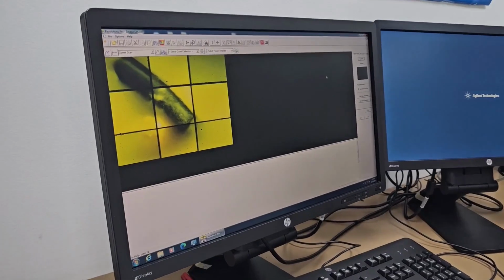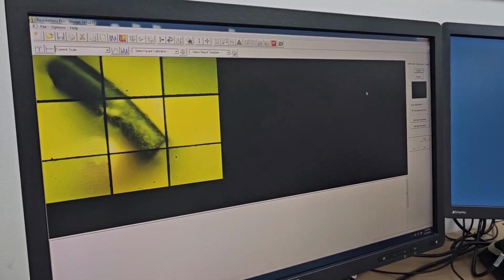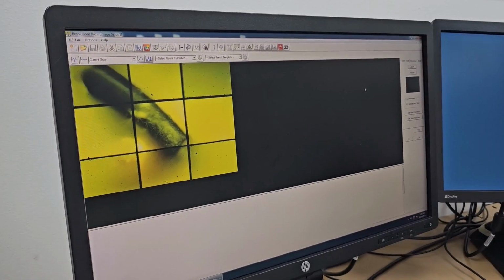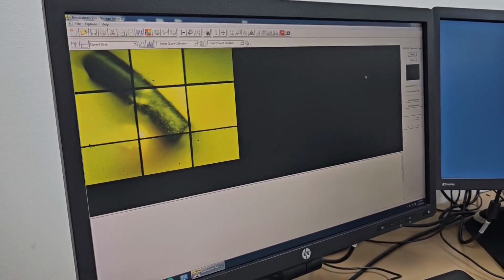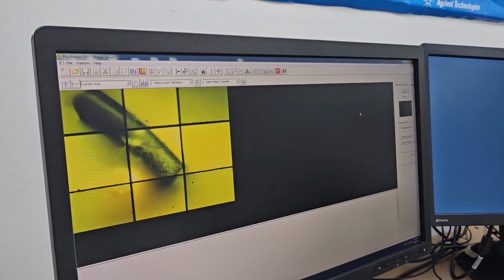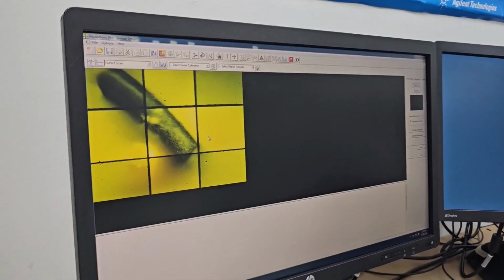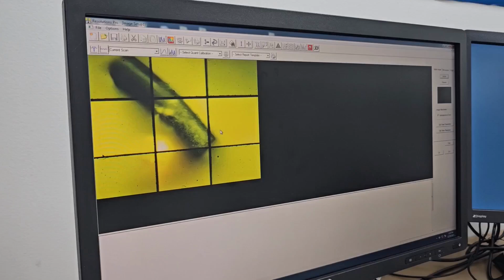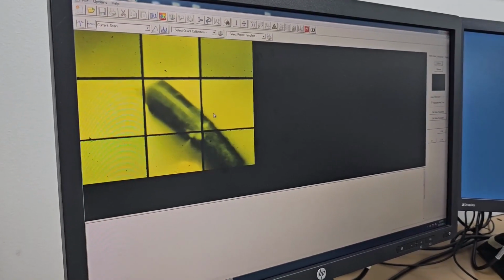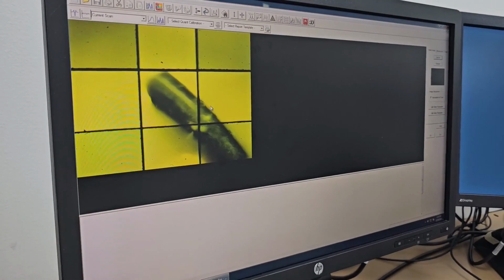We are searching this sample. We found this interesting sample, plastic. It looks like rubber, so we'll try to analyze it now. First of all, we need to focus. As you can see, it's focused. However, you also see some dust on the sample. We'll try to avoid that as much as possible by choosing a clean area in the sample, like this.